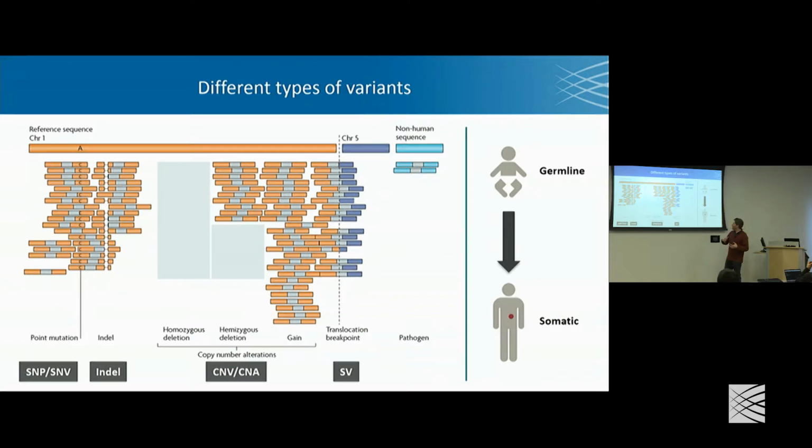There's also other classes of variants, such as copy number alterations. In that case, what you have is a piece of the genome has essentially been duplicated or removed relative to the reference. So what you end up seeing is either too few reads than you would expect, either half or zero typically, or if you have a duplication, you'll see extra reads relative to what you would expect, because now more DNA represents that region, so you'll get more reads.